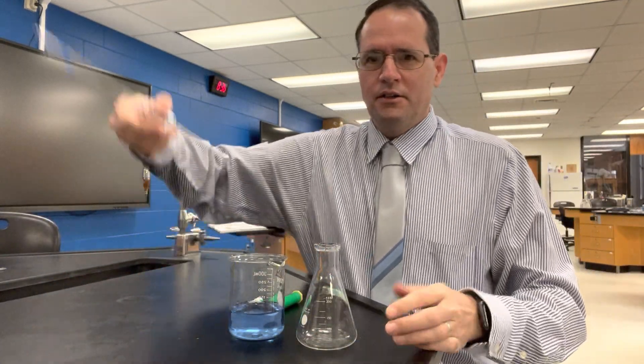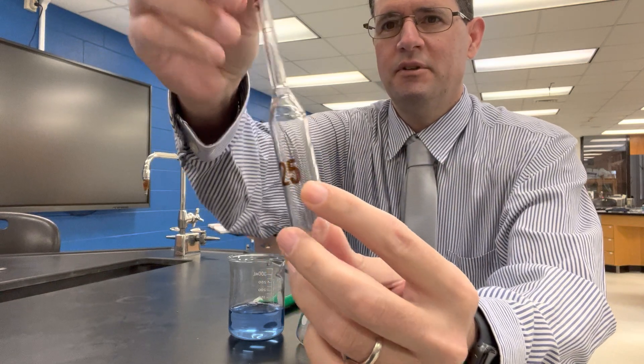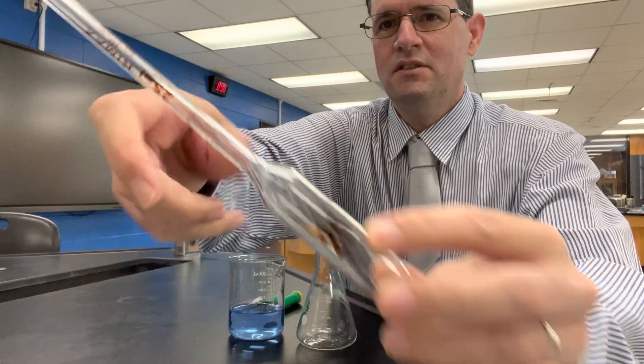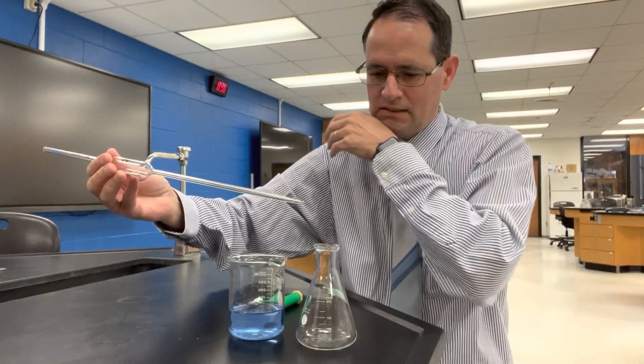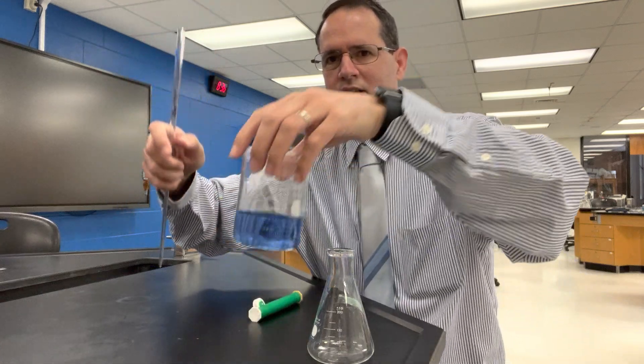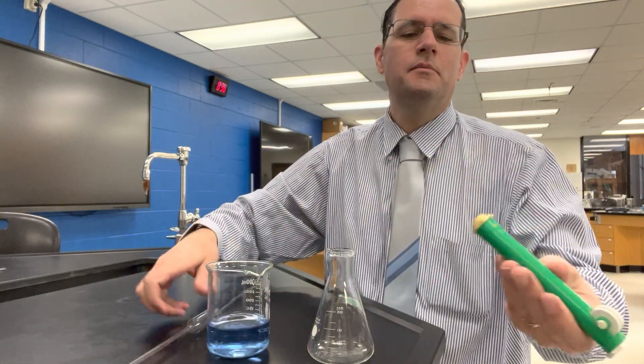In this video I want to show you how to use a pipette. This one here is 25 milliliters, and if we fill the device up to the meniscus it's designed to deliver exactly 25 milliliters of a solution to our Erlenmeyer flask. I've got this colored water here to demonstrate.